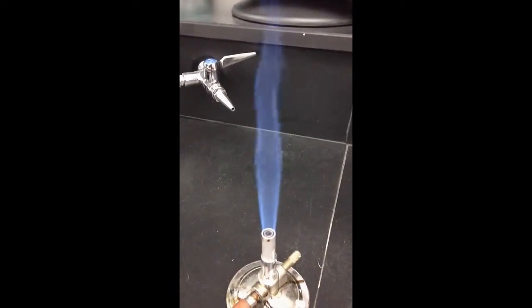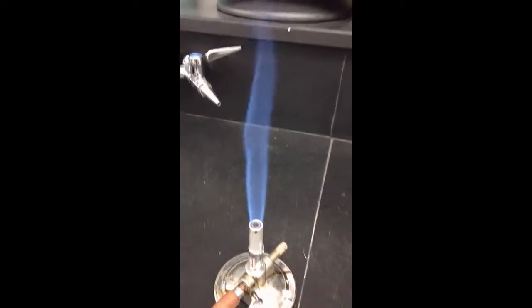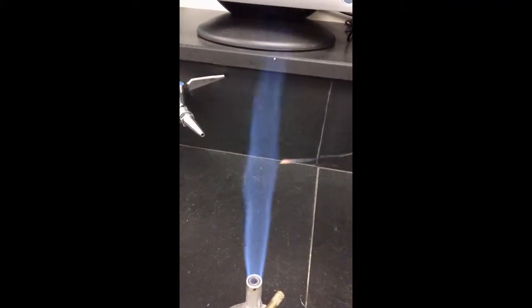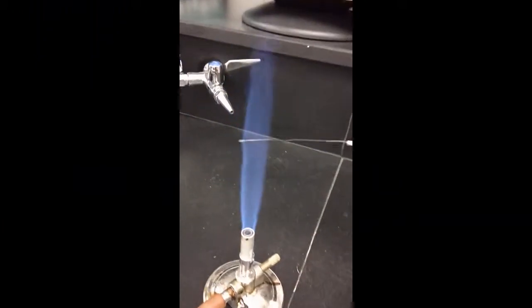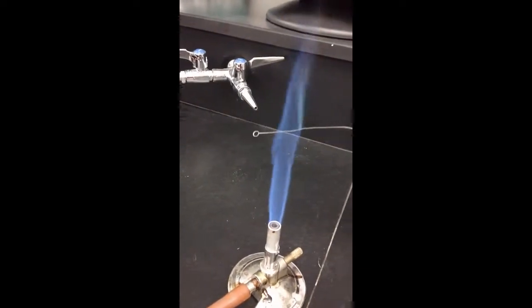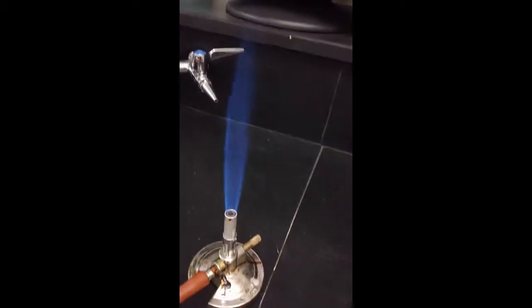You wanna write down what you see. Again, this is test A, FE. Just see it? Super quick. Okay, I'm gonna make sure I clean my rod. Okay, so the next chemical I'm gonna do is ZN. Right here, this is my zinc.